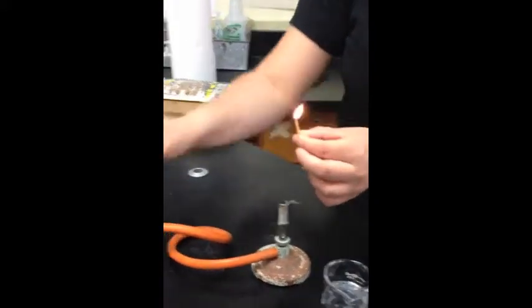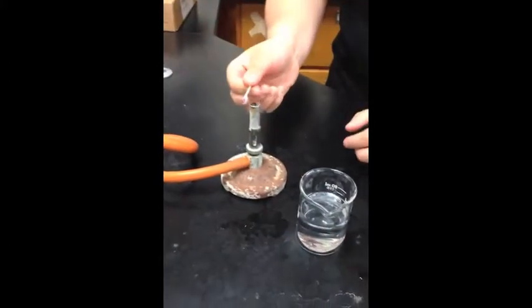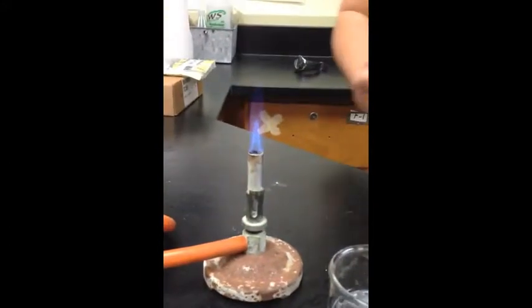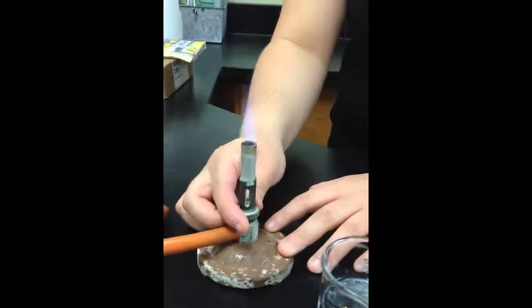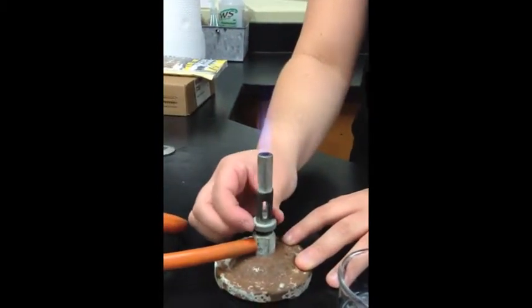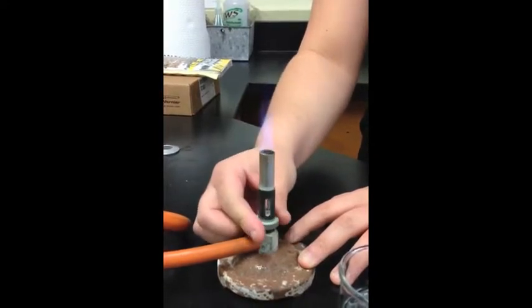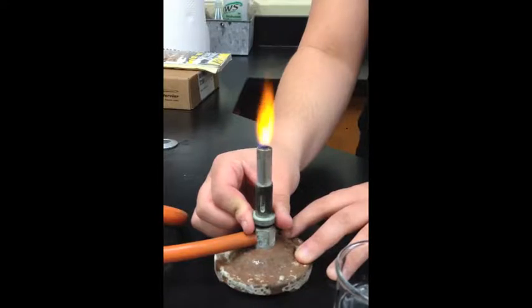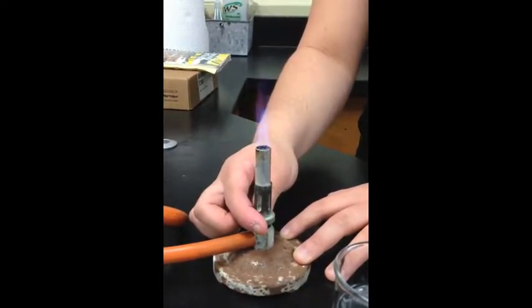Once you have the match, you can light the gas. Place the flame over the Bunsen burner and you'll see a flame appear. Once you have that, you can adjust it to any setting you want — you can make the flame higher or lower. You want to make sure that you have a little blue flame in the middle, because that's the hottest part and that's what you're going to use.